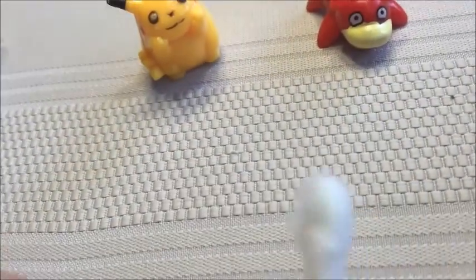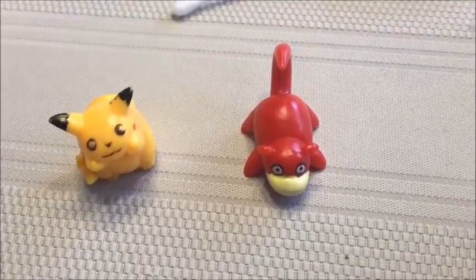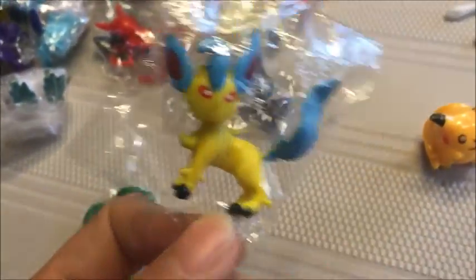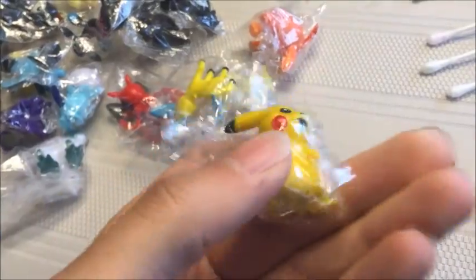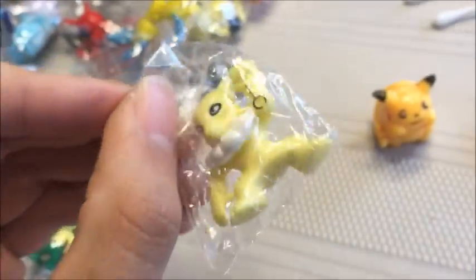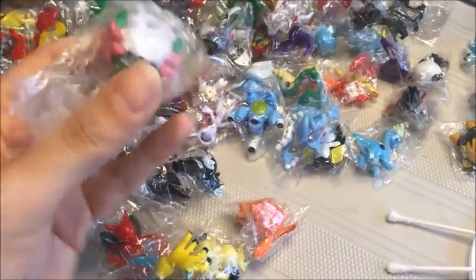Not saying that all of them will test positive. I won't even say the Slowpoke one is definitive, because there's very little on there. Nevertheless, I don't really recommend buying the knockoff Pokémon toys, because they just look terrible anyway. And I will be getting my money back for these, because I'm not paying $65 for knockoff Pokémon figures.